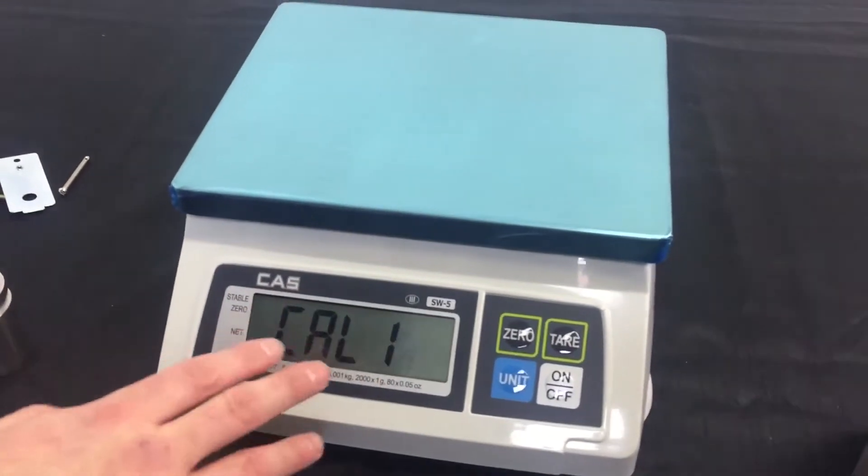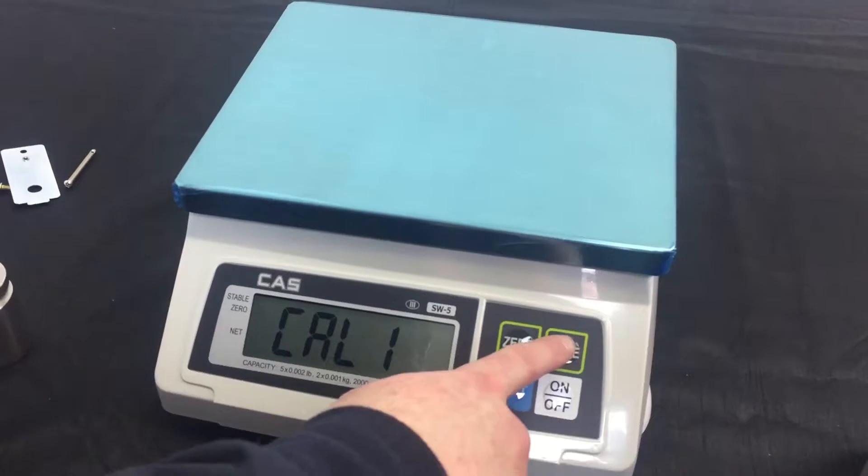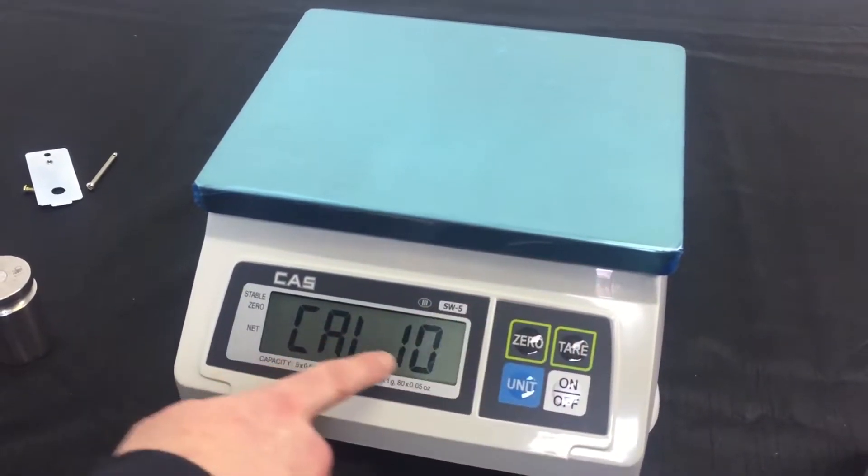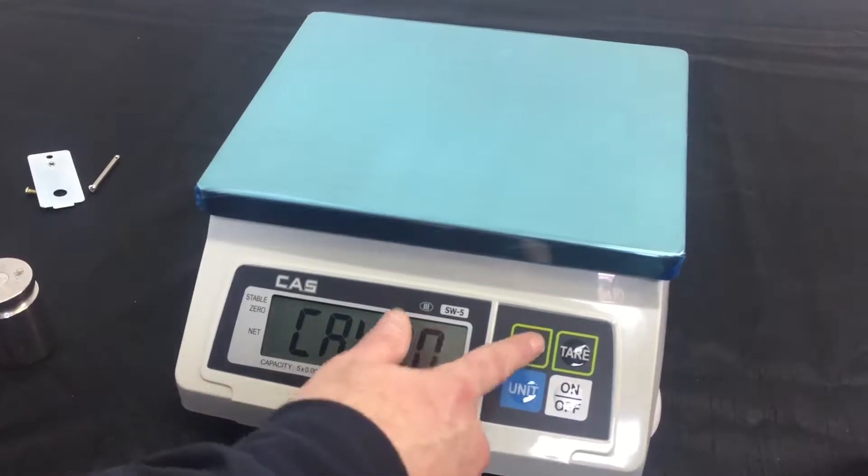Now, what we're going to want to do first is navigate to cal 10. You do so by pushing the tare key until you see cal 10 on your display. In order to enter into the setting, press the zero key.